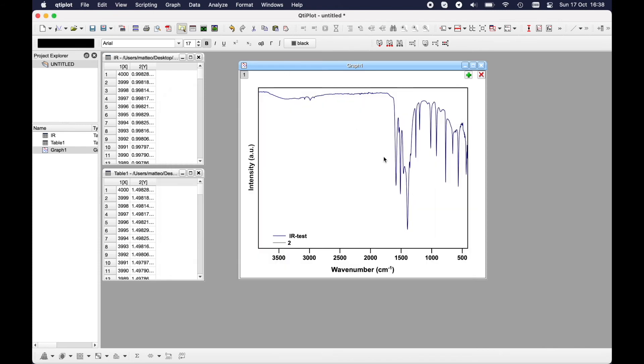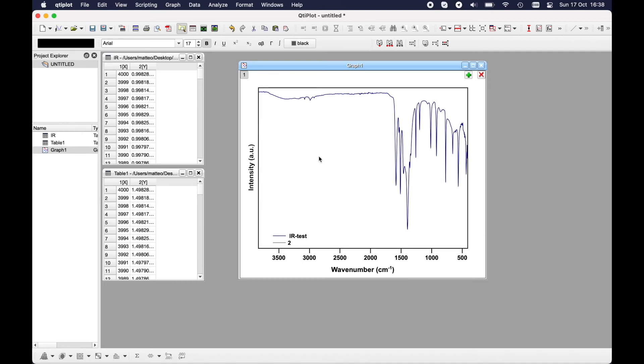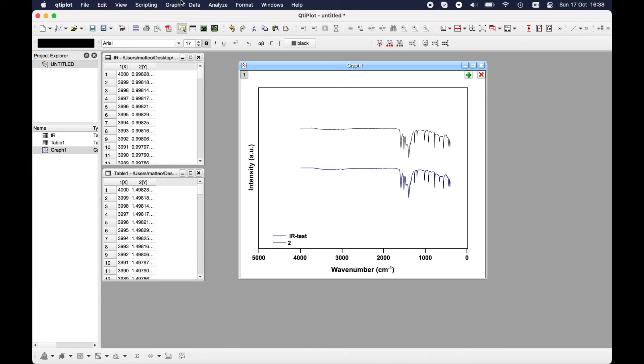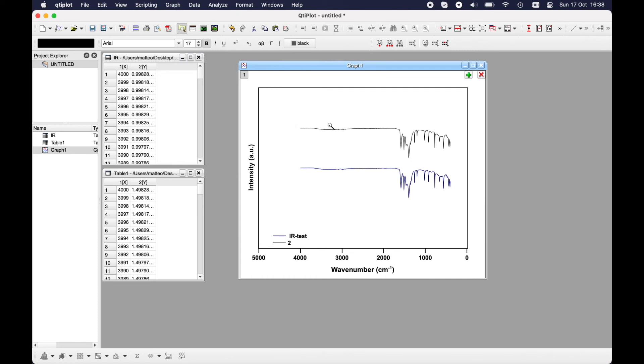You can't see anything because it is out of range, so I will resize it by using the shortcut Command Shift R and you'll see both spectra here. Now I would like to zoom them, so zoom in from here to here.